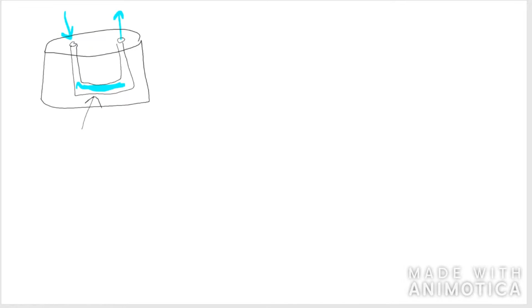So here, that would be the body of the microfluidic chip. And applications of this chip can range from clinical diagnostics, DNA sequencing, toxicity testing, just to name a few. These are largely biomedical applications, but other laboratory procedures can also be processed in a microfluidic chip.